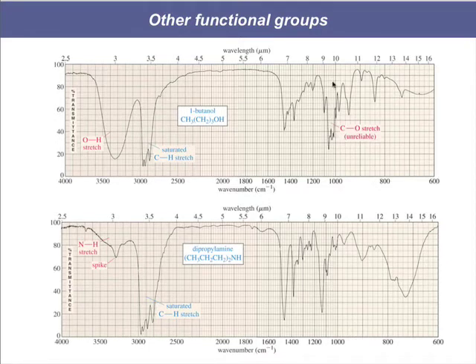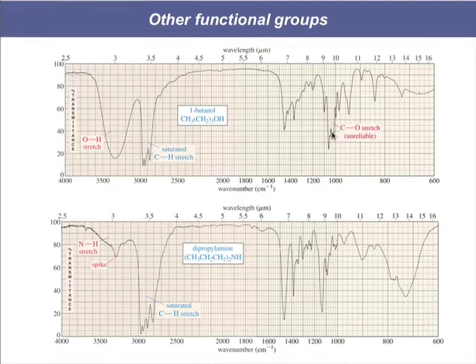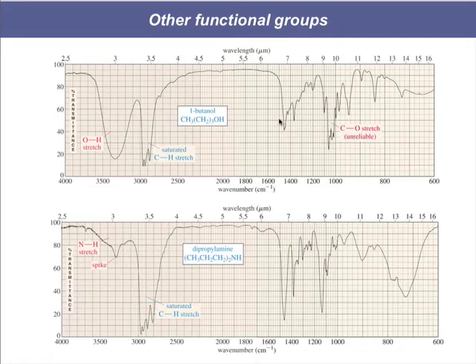so that's not a reliable peak. That peak could be coming from lots of other things, depending on what's going on in the molecule. But basically, if we ignore anything below 1400 and only look at things above 1400, all that we can tell is we've got an OH and an alkane. This turns out to be 1-butanol. We see our alkanes and our alcohol.